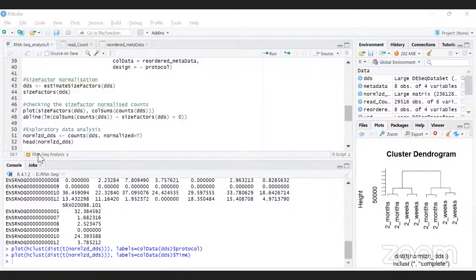But if you're looking at differential expression of transcripts, where these transcripts are generally present everywhere and you want to look at transcripts that are only expressed in a specific condition, then you would want to go with transcript analysis.